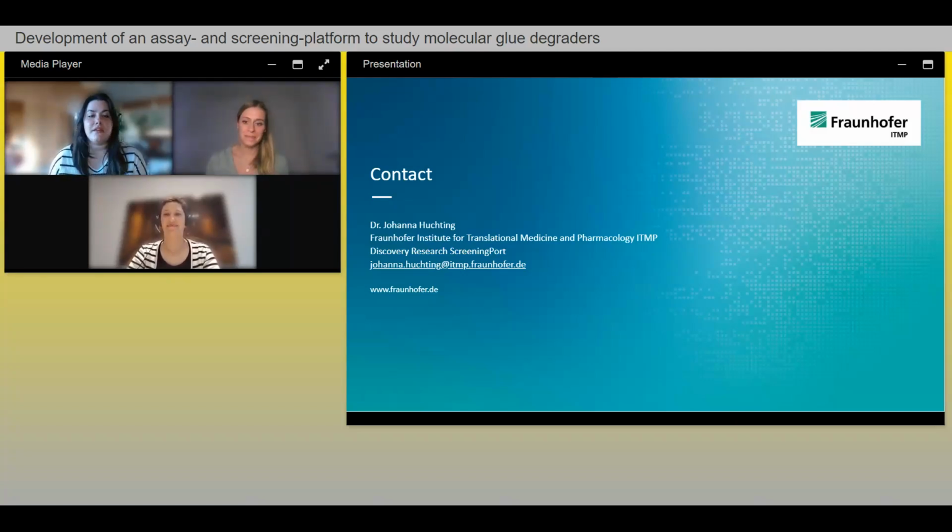Excellent, thank you. Not a problem at all. All right, so it looks like we have time to fit in one more question here. This last question we'll ask today says, which are the most common optimization steps to be performed to have a robust HTRF assay?